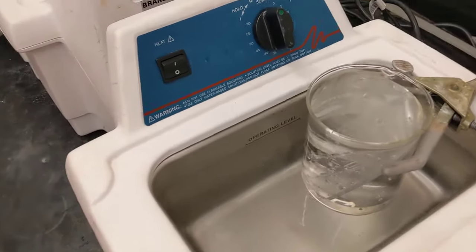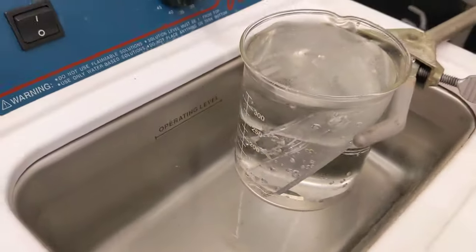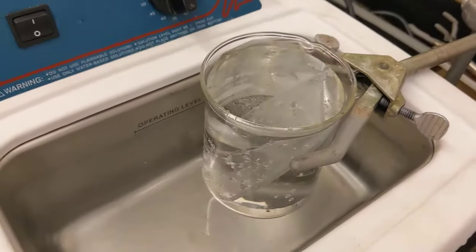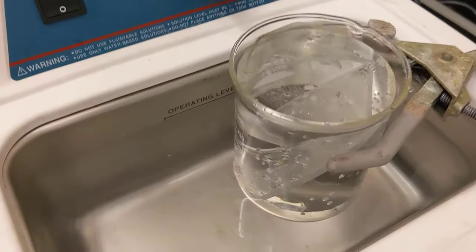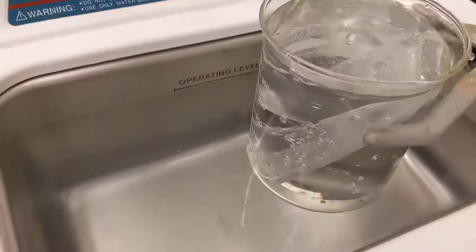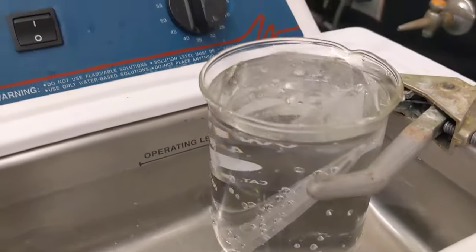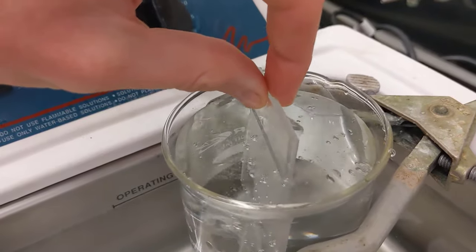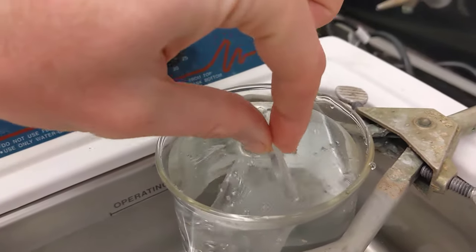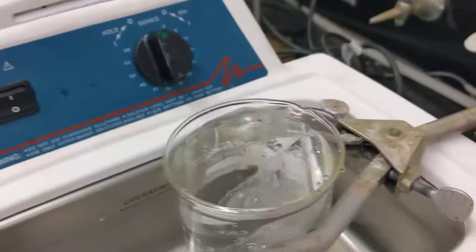This is what the actual beaker would look like with the object that you want to clean. You want to make sure that your object is fully submerged inside of that beaker — you don't want any amount of it sticking out, otherwise that region won't get cleaned. It has to be fully submerged.